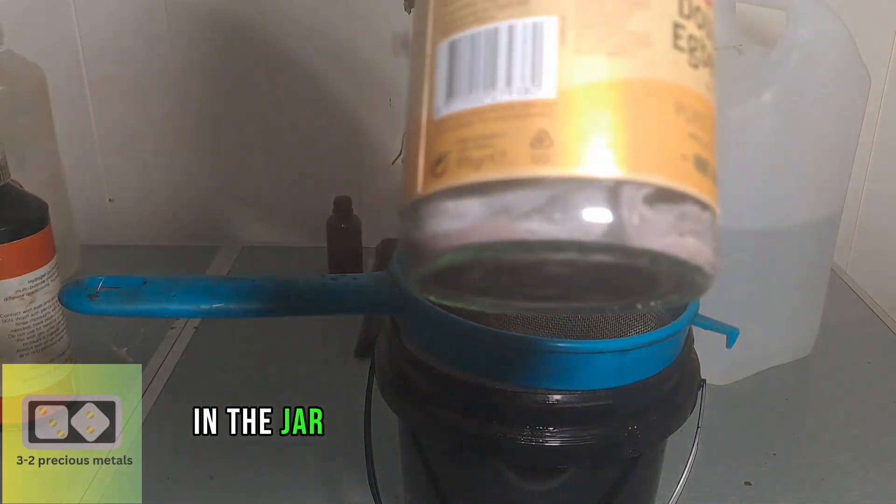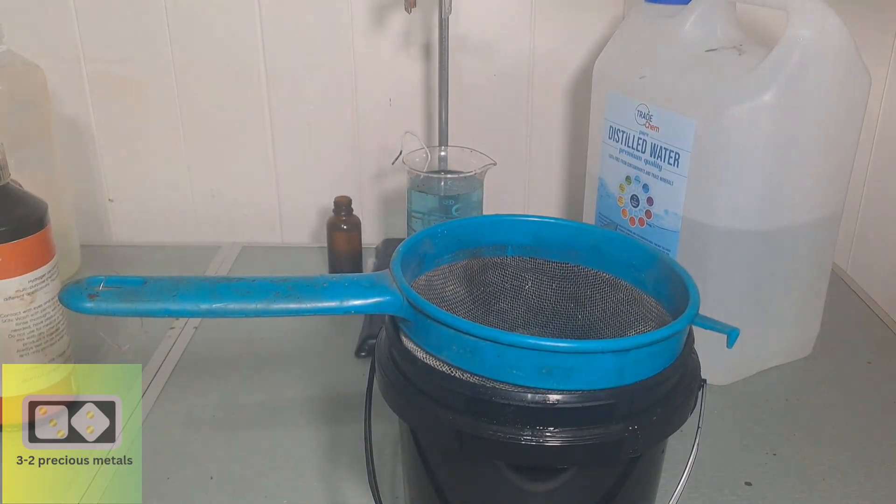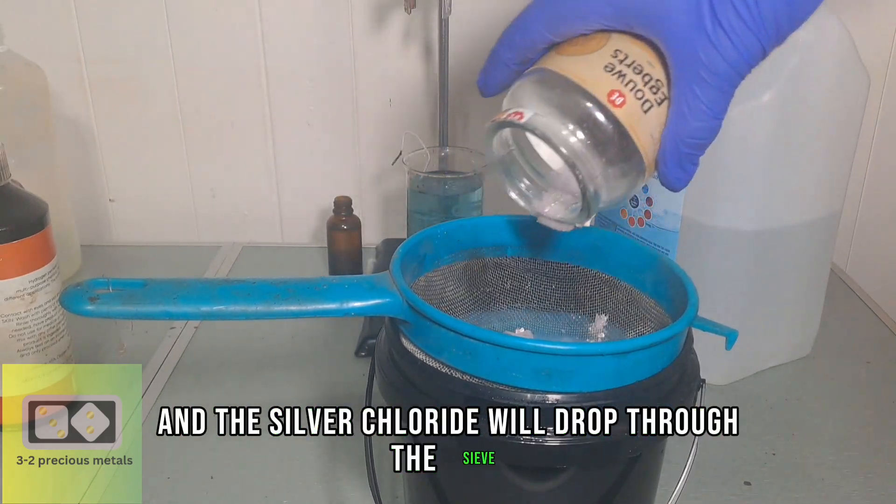In the jar, I already have some silver chloride with some filters. So I'll rinse the filters out and the silver chloride will drop through the sieve.